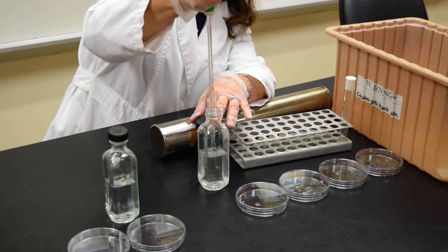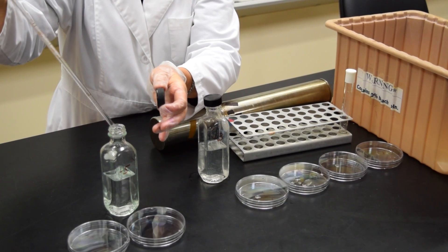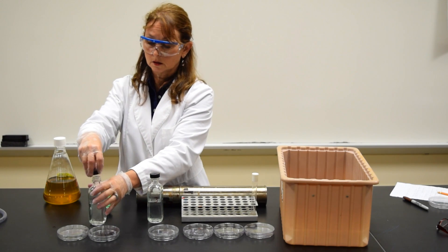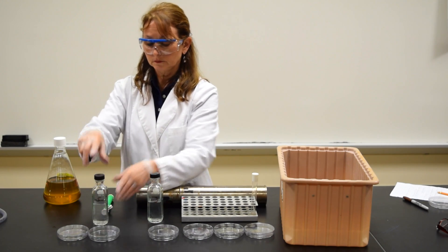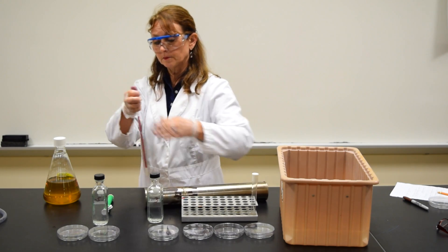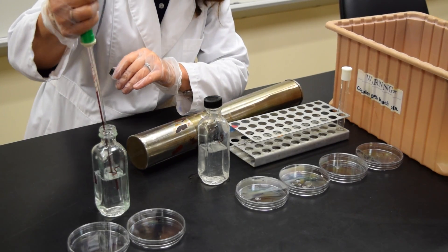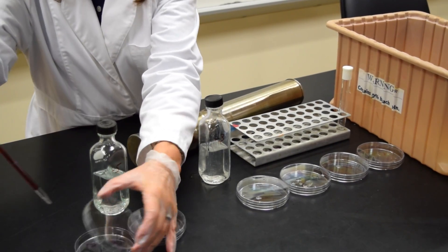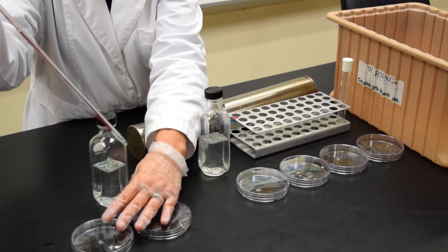Using the same pipette, draw another 1 ml from the minus 3 bottle and place it into the minus 5 bottle. Change the pipette, cap the bottle, shake it, remove a new pipette, draw up to 1.1 ml, dispense 0.1 ml in the minus 6 plate, and the remaining 1 ml in the minus 5.